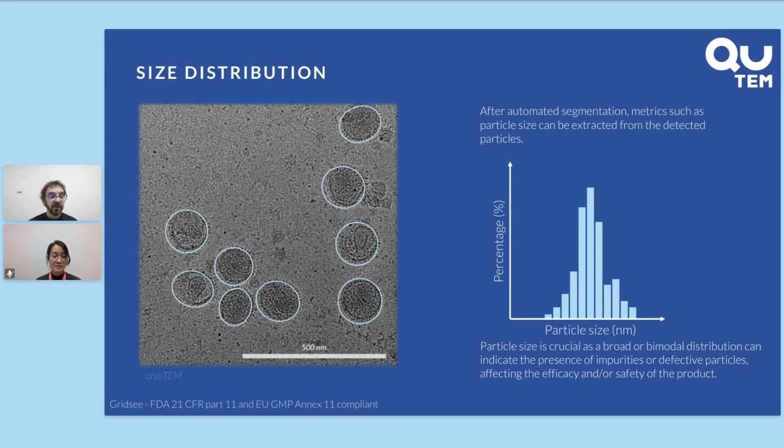And we are also implementing some other AI tools nowadays, such as support vector machine, SVM, for example, for the classification of other particle types like VSV, if you are familiar with it. So in brief, we always try to have as much support as we can from our software, but no matter the data, it's always verified by trained and qualified analysts.